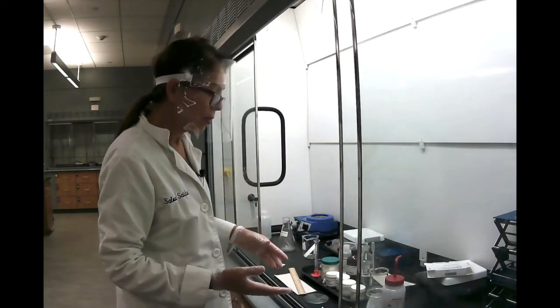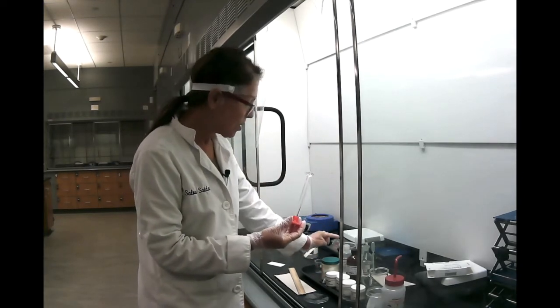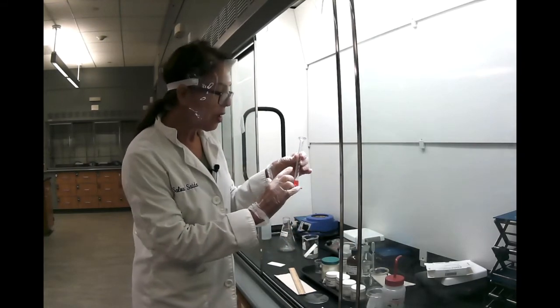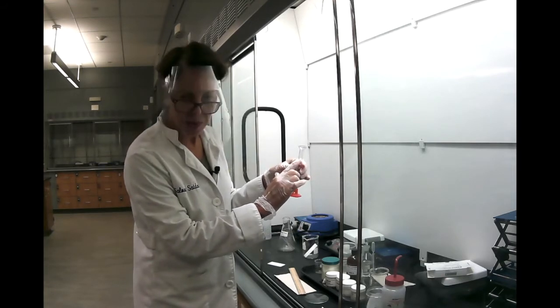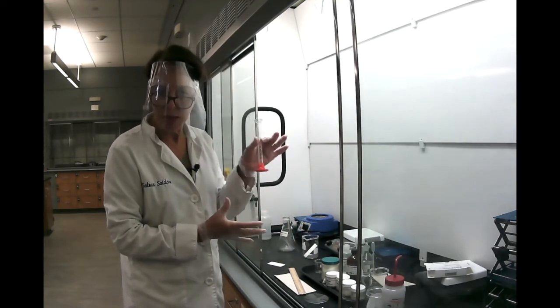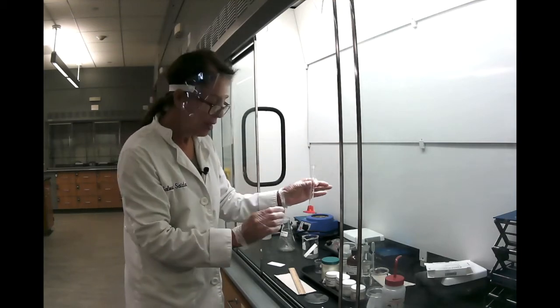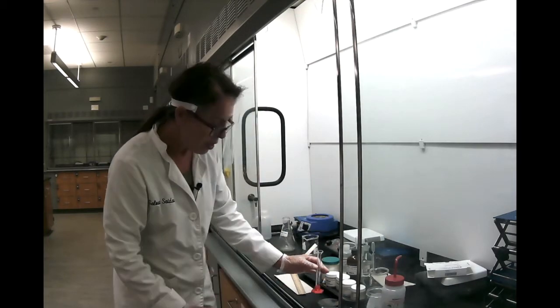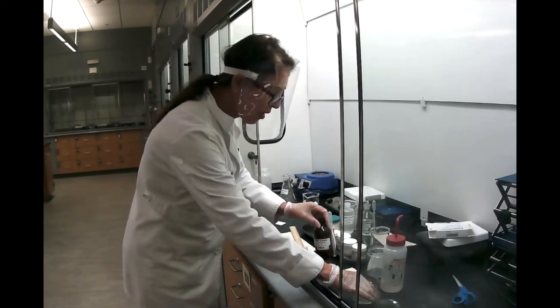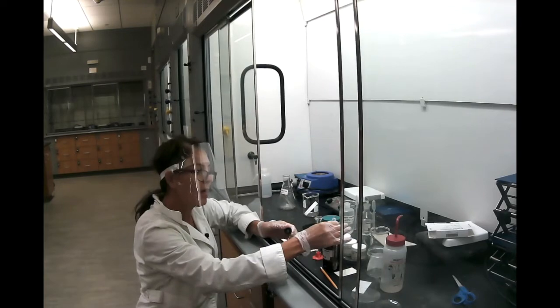Now, what type of mobile phase are we going to use in this experiment? The procedure tells you you're going to use ethyl acetate and glacial acetic acid. So ethyl acetate, we need 9.5 milliliters, and we need 0.5 milliliters of the acetic acid. Now, how do we use a graduated cylinder? This is very important. I see sometimes students holding it and pouring the liquid in. That's never the right way. So what you do, you put your graduated cylinder on a flat surface, then you bring your liquid and you pour it in, and here it's best to use a pipette.